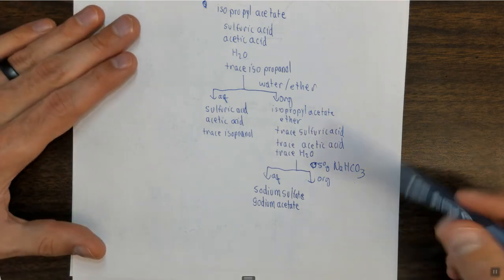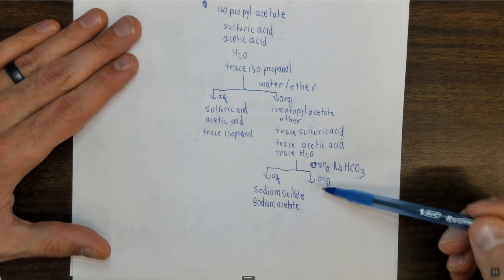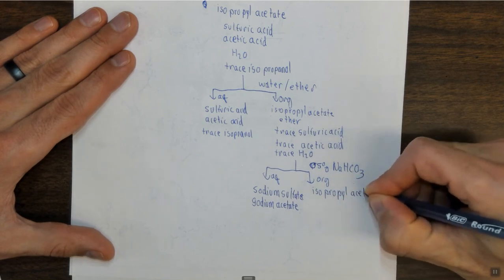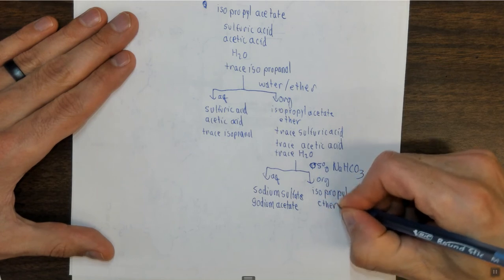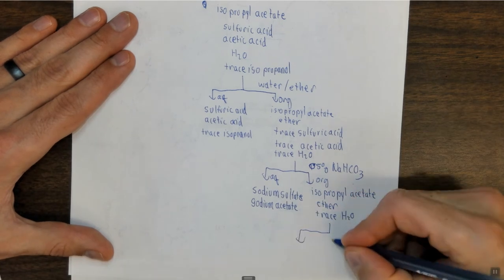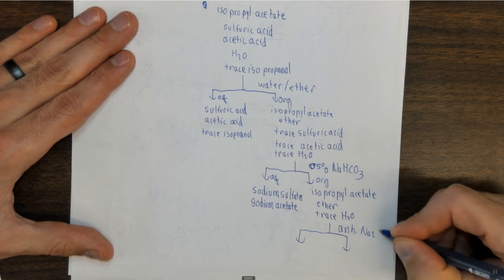All right, so now we've got these two things, sodium sulfate and sodium acetate. In the organic layer, we of course still have our isopropyl acetate, our ether, and our traces of water. So we've done this a bunch of times. To get rid of the traces of water, we add anhydrous Na2SO4.